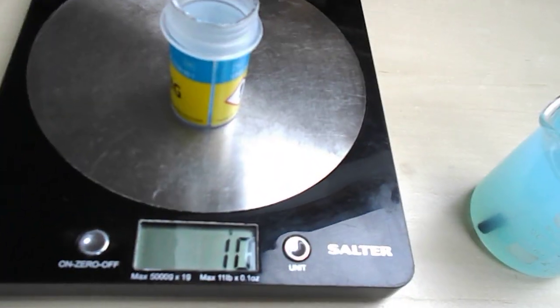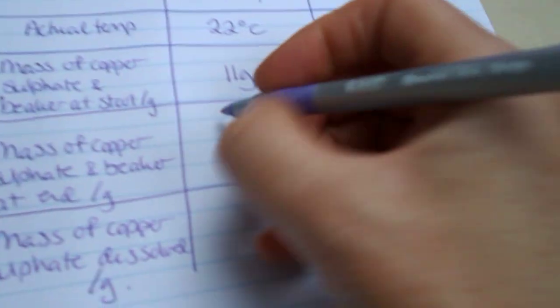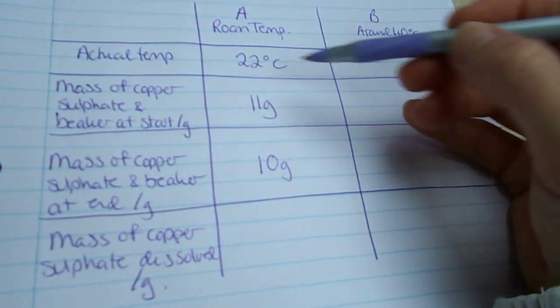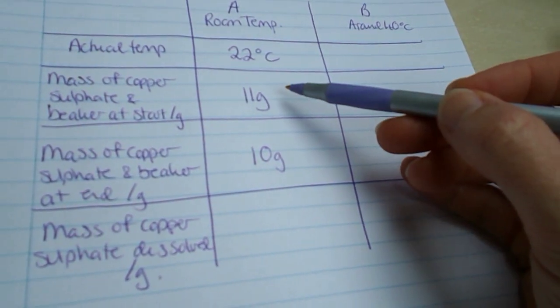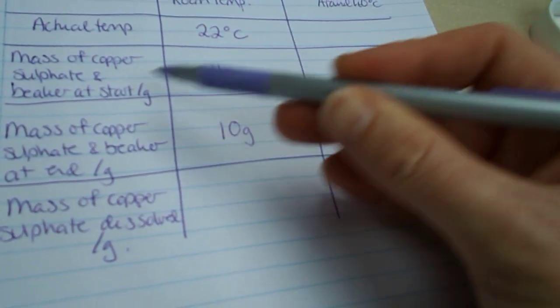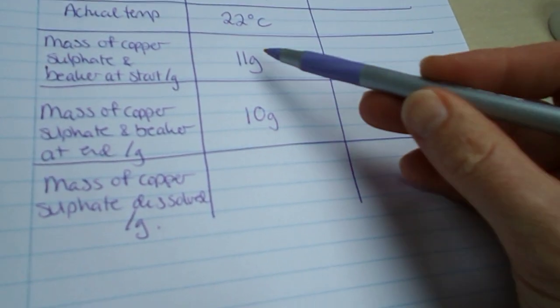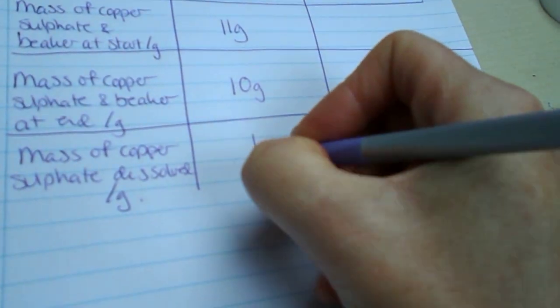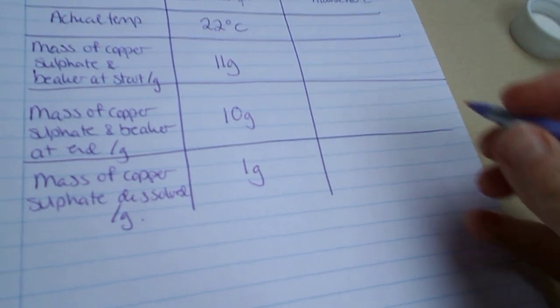okay, so say this was the end, and can you now see on my balance that that is 10 grams. So if I pop that into my results table here, if at the beginning our mass of copper sulphate in the beaker was 11 grams, and after adding the copper sulphate to the water, the mass of copper sulphate in the beaker was 10 grams, then the difference between the two is going to tell us how much has dissolved in our water there.